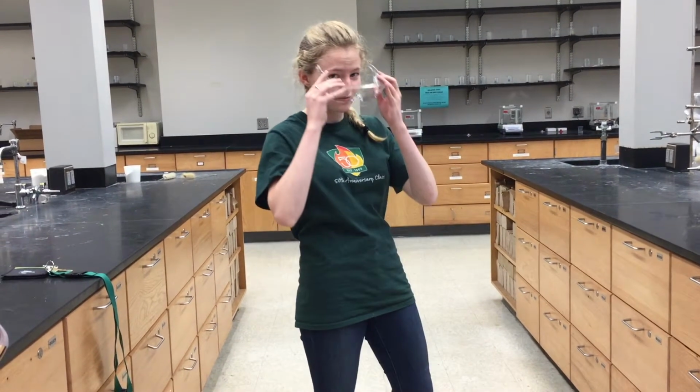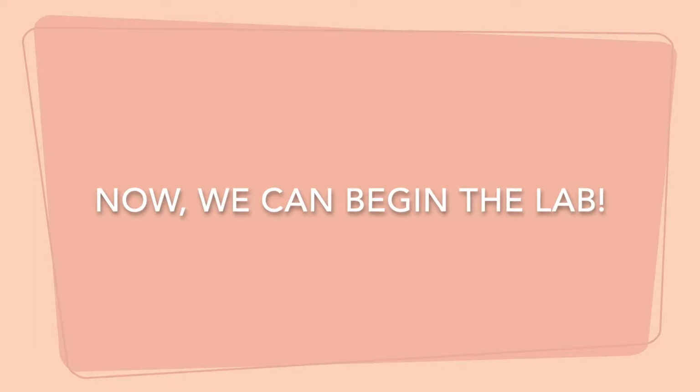volume. Before starting your dilution, make sure to wear your lab goggles, a sleeve shirt, and long pants. Also be sure to wear closed-toed shoes. Now we can begin the lab.